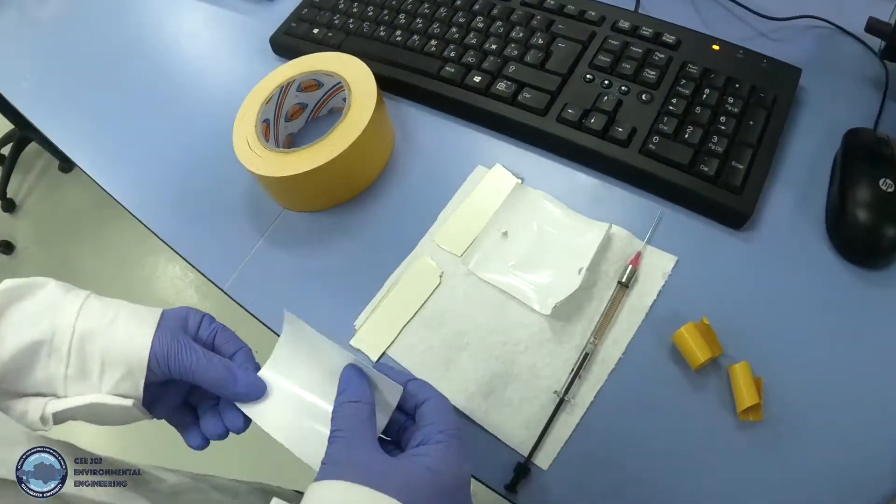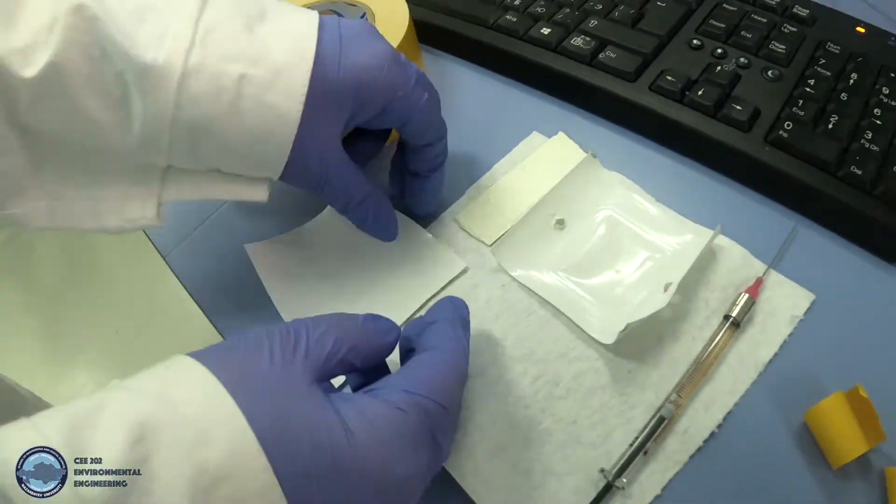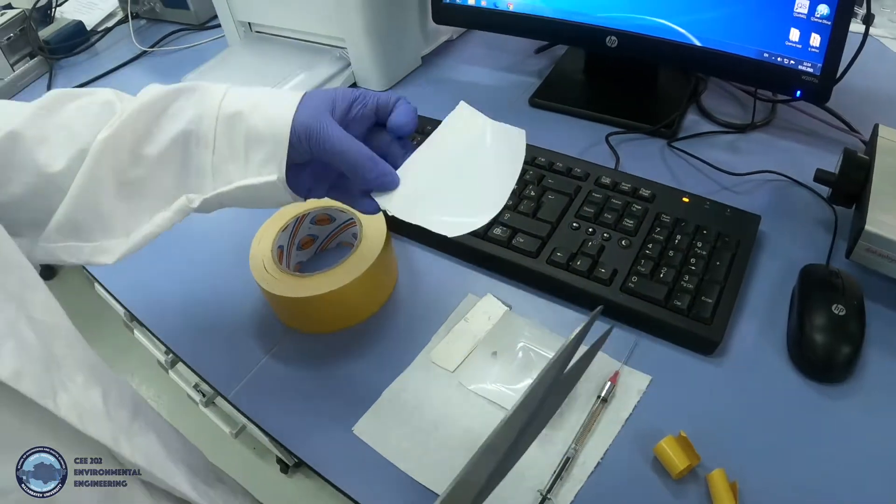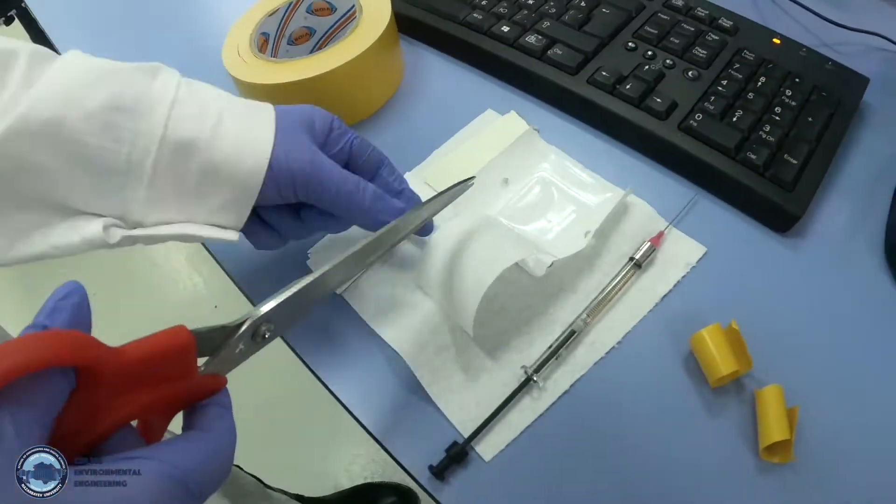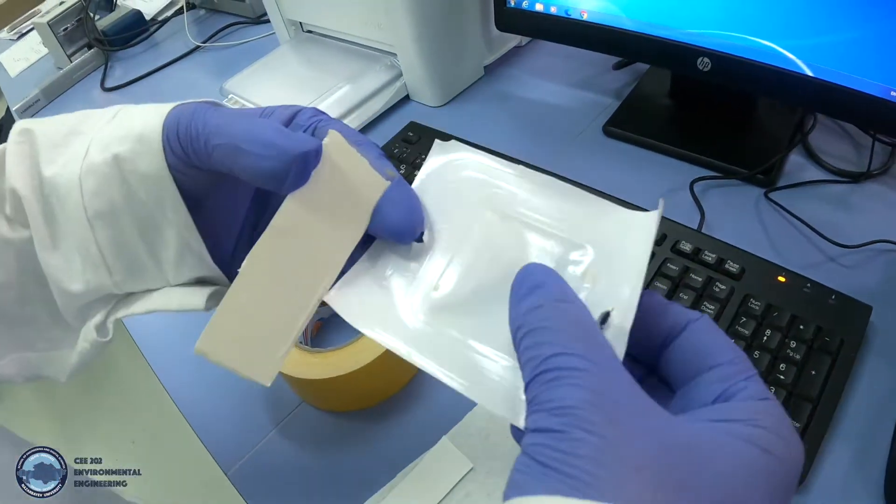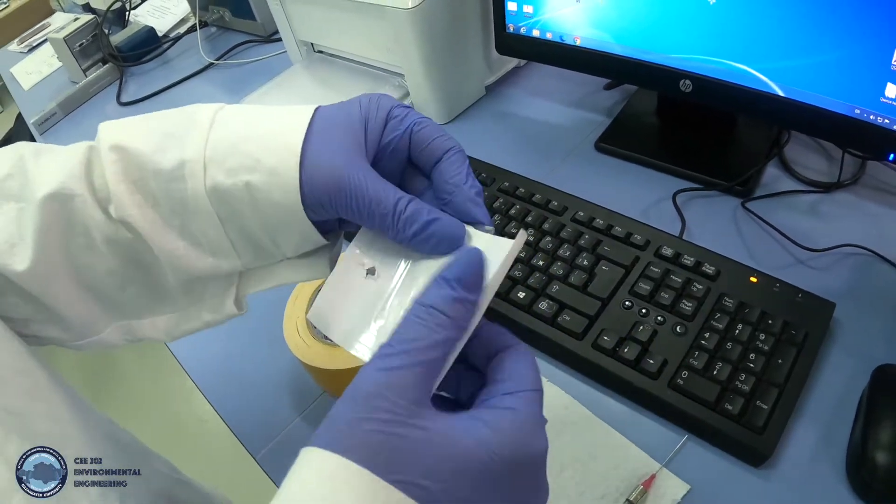We will place virgin PES membrane on the first glass plate with the tape and cut around that glass plate. Now we will repeat the same procedure with fouled membrane.